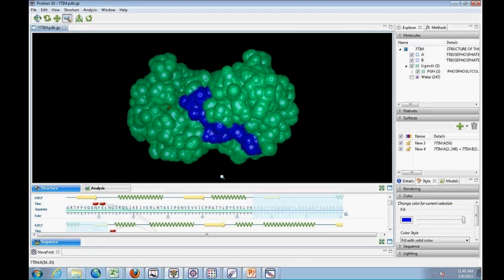So we can do either protein structure files, which you can download straight from the PDB database. And if you don't have a structure file for your particular protein of interest, you can also use a sequence text file that you can open up. And you can still do the analysis view and do all of the applied methods on that particular sequence, even if you don't have a structure file as visualized here. Great, thanks.